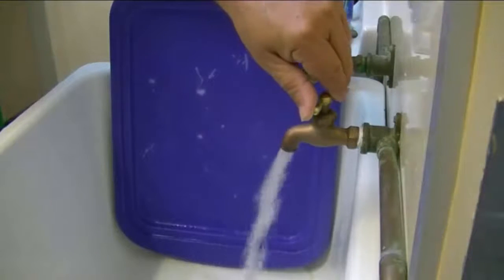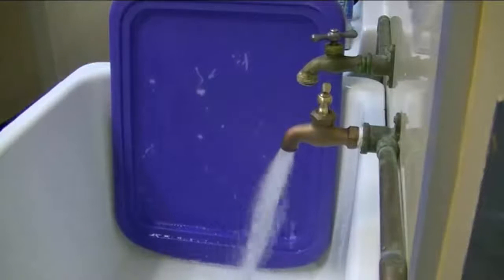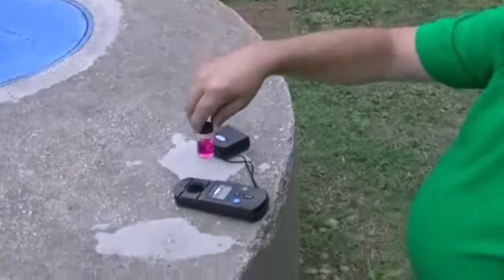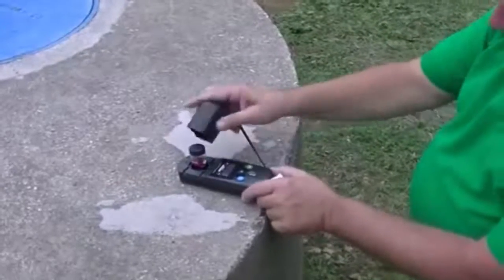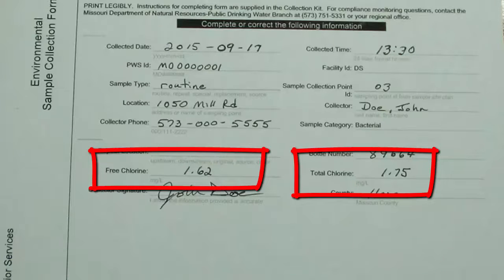Before collecting your sample, flush the tap fully by opening the valve all the way and letting the water run for several minutes — 3 to 5 minutes is recommended. While flushing, test your water for free and total chlorine residuals, or for monochloramine residual depending upon the disinfectant used, if your supply disinfects its water. Write your results on the accompanying sheet.